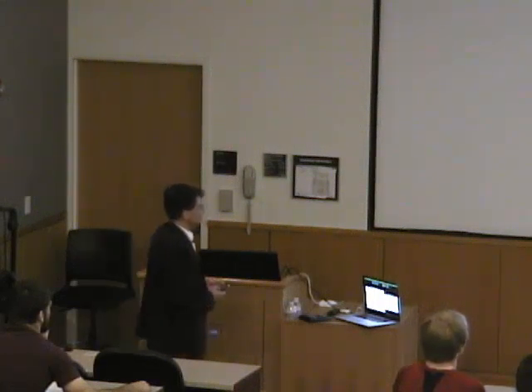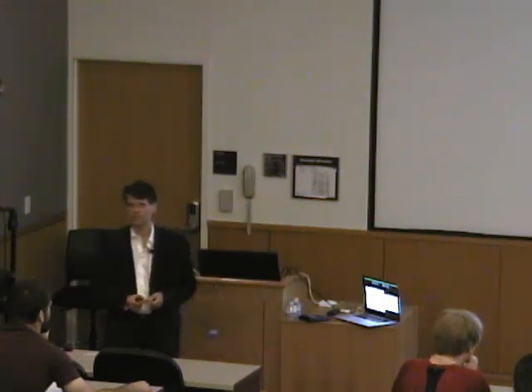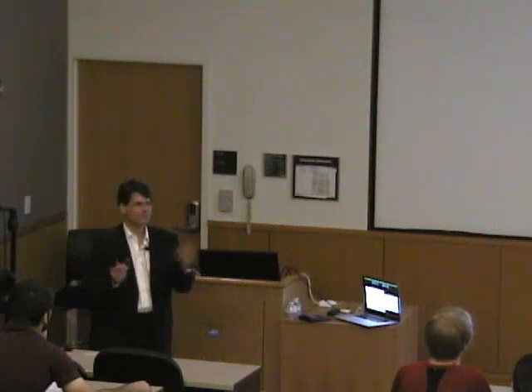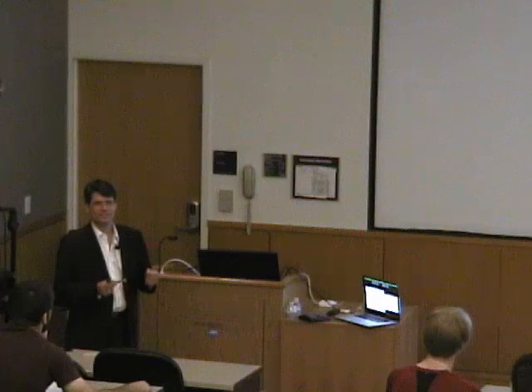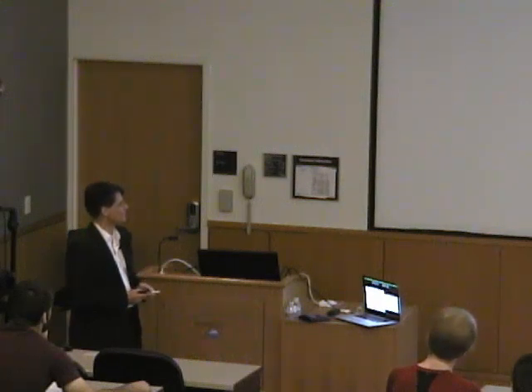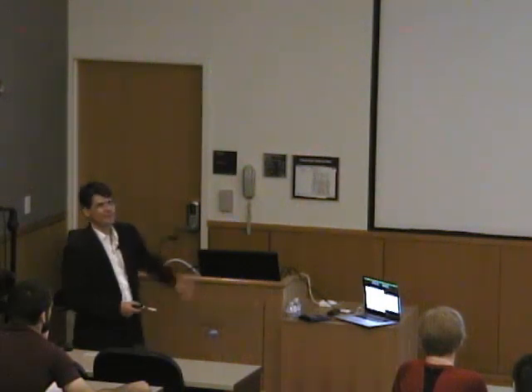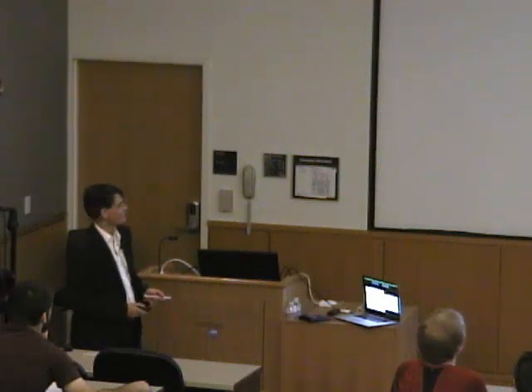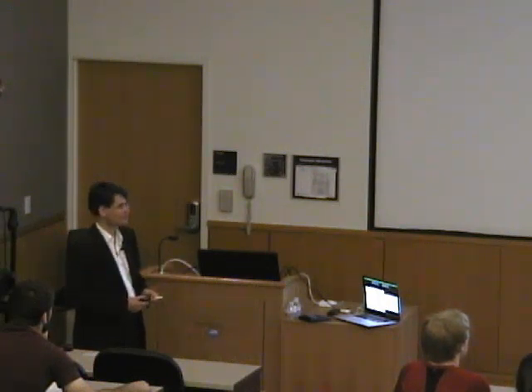Now, if you try to conduct an absorption experiment in the near-infrared region of the spectrum, I don't know how many of you have done that. When I was a PhD student, I had a nice little old Carey spectrometer, and I took my sample. I was all excited, and I thought, okay, let's measure all the way up to 2,000 nanometers. I was scanning and scanning, and then came 1,200, and then the spectrometer went bang and made funny noises. And the reason for that, of course, is that in that region of the spectrum, you have overtones of water vibrations, right?